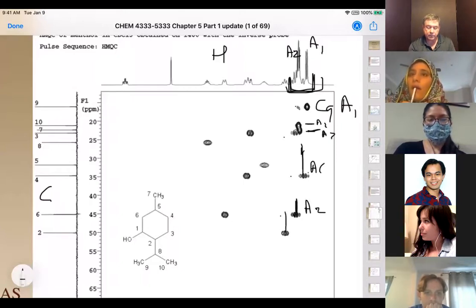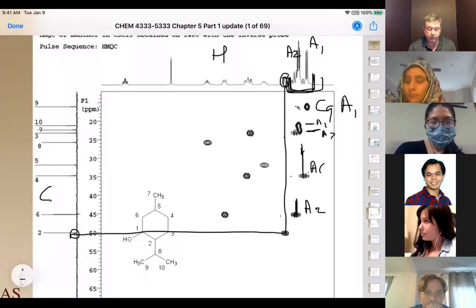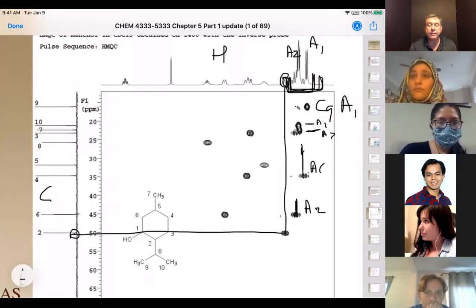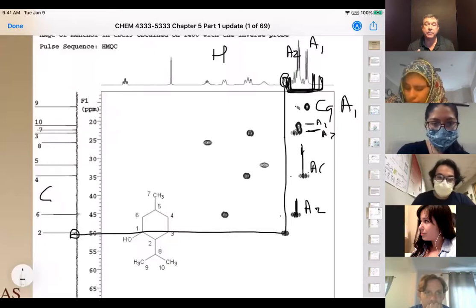And then this one is actually separated out, so this one right here is only on carbon number 2. That means we have 1, 2, 3, 4, 5, 6 carbons that have this type of hydrogen in them, and so their shifts are very similar, and they should look fairly similar.